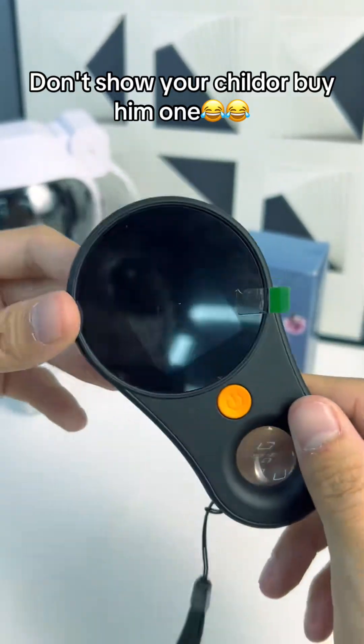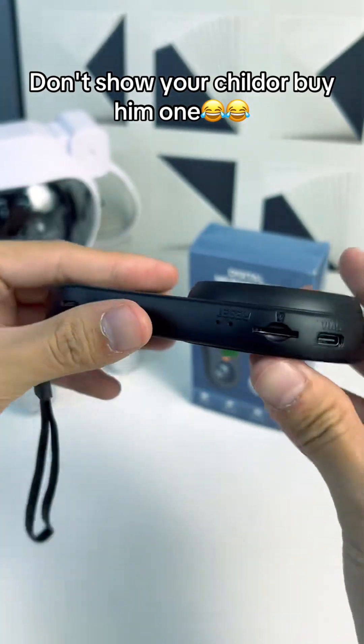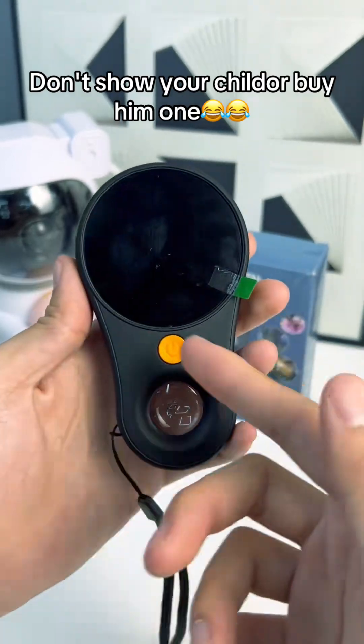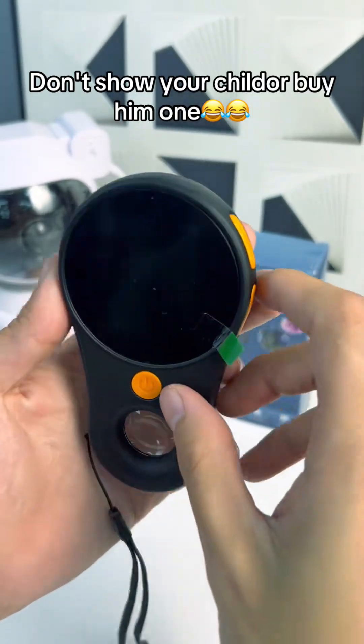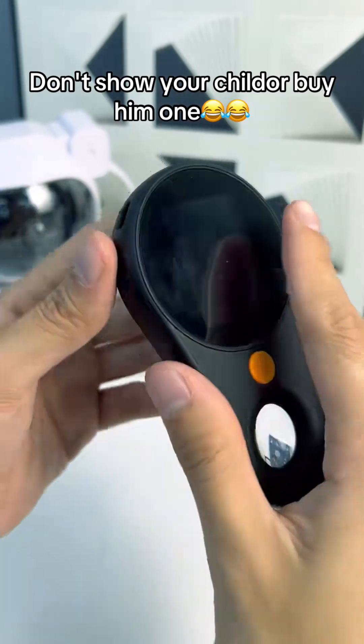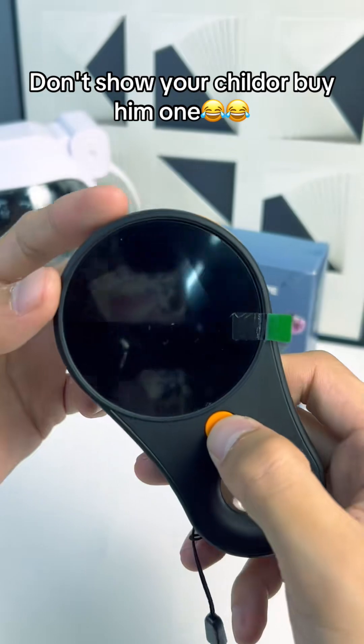I have been so excited about this. This is a digital handheld microscope and what a great gift for the holidays. A little scientist in the family or anything like that, any kid that likes looking at things up close — check this out.